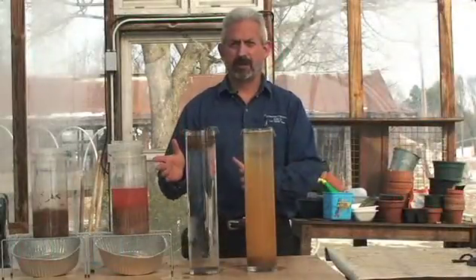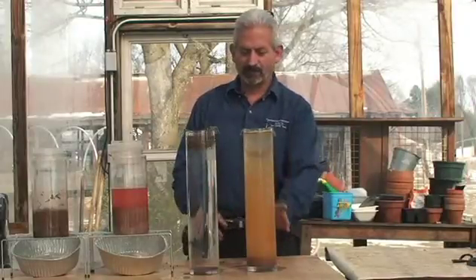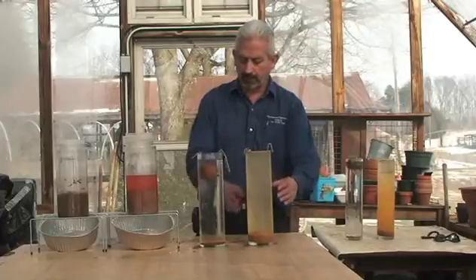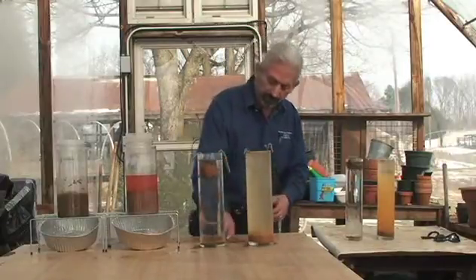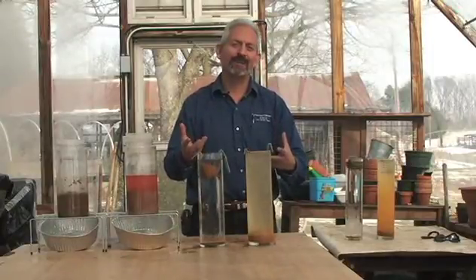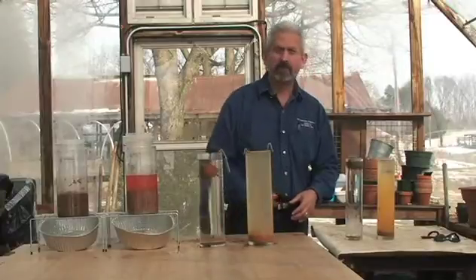We did this Slake Test 30 minutes ago. As you can see, there's color differentiation between the two cylinders — one is clear and one is still clouded with suspended clay particles still floating in the water. The no-till aggregate is still largely intact because many of the biological cementing glues are hydrophobic — they repel water but still hold the particles together. The tilled soil had very little to no cementing agents or biological glues, so all of it fell apart and landed at the bottom.